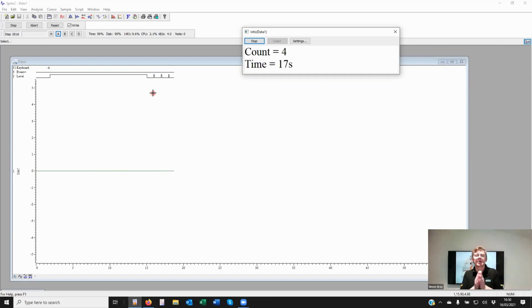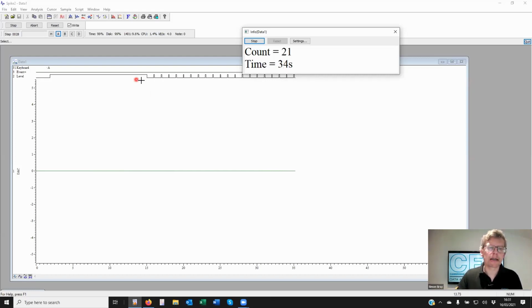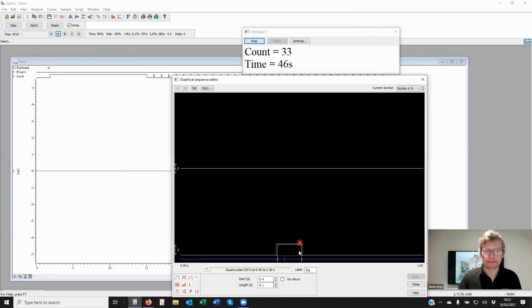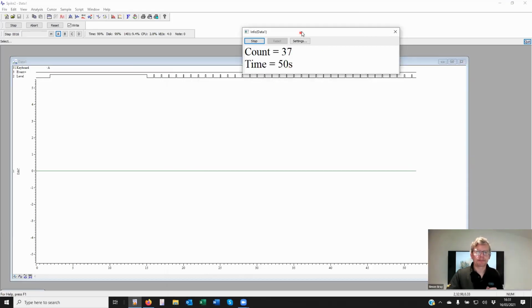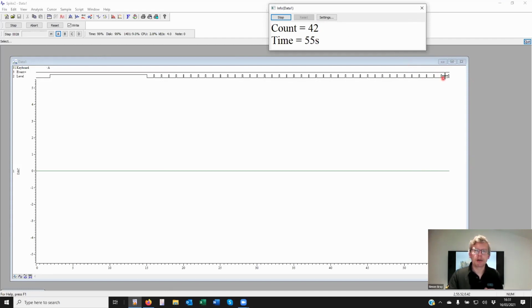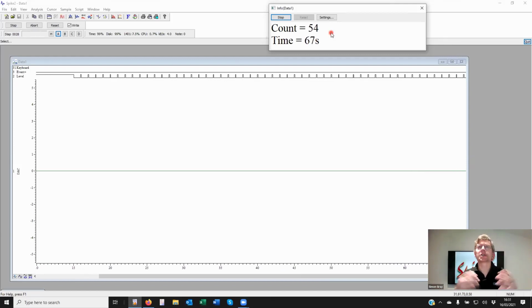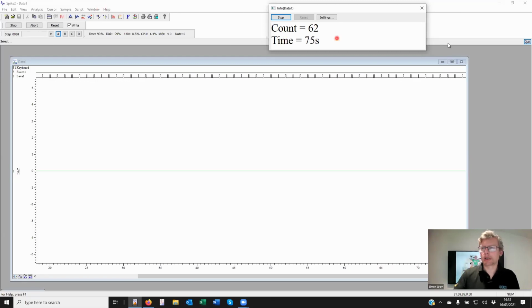So the 15 seconds sample time was matched. And then we had a little bit more time before we finished off the pulse. And then we've gone round again through that section, sending out the same pulse again and again. But since the 15 seconds that we specified as a sample time has gone, all of these pulses are only as long as specified here, so 0.1 of a second. But notice I'm seeing a count here. Every time we see a pulse, I'm reading out a count so I can know how many pulses I've sent out throughout the recording. And that same variable can be used within multiple sections, either reset or just accumulating a count of every stimulus that was applied.